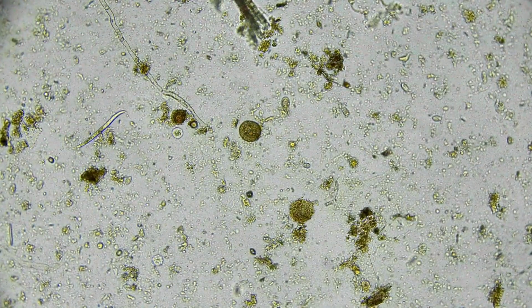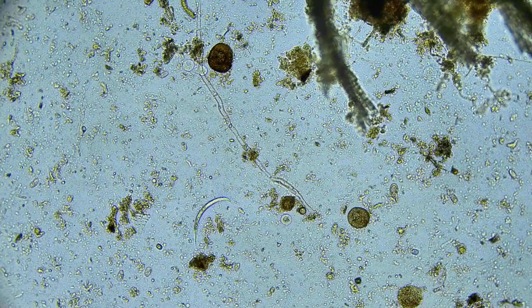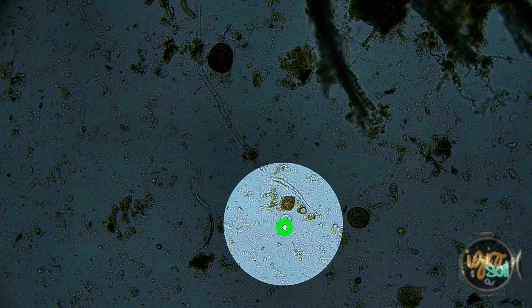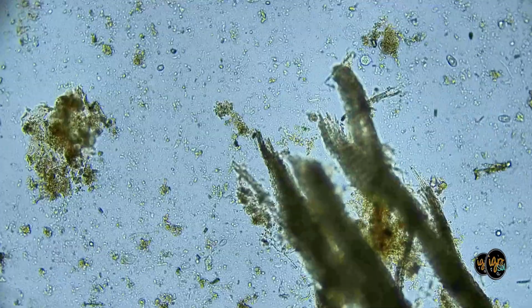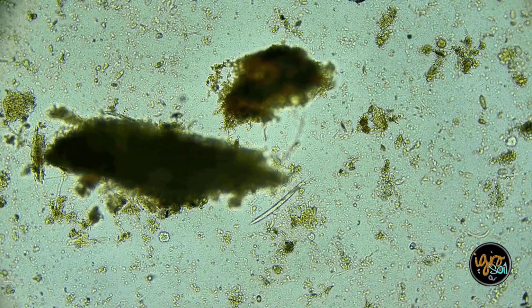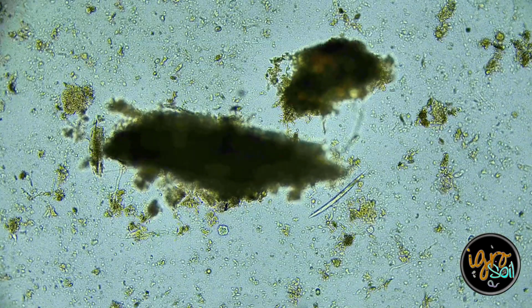There's a lot of Arcella in here, right? That's another big Arcella. I'm at 100 magnification. There's another one there. There's this guy here. I'm seeing enough of this that now when I'm paying attention as I'm observing more and more mushroom, I'm looking for that. And I'm at some point going to say, okay, that's part of a mushroom block. That's going to be part of the hyphae that's in it. Again, have to observe it enough.